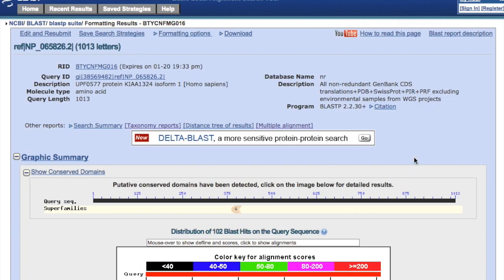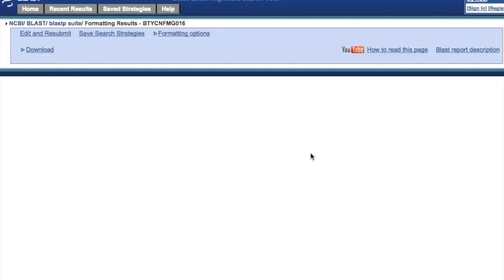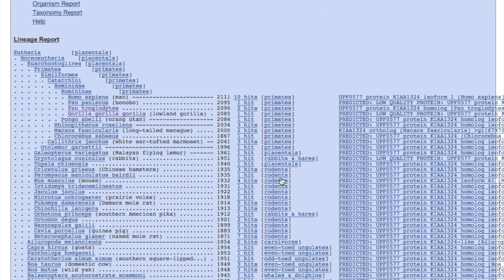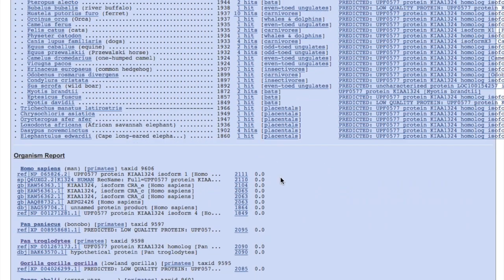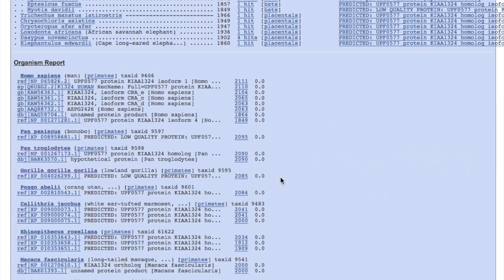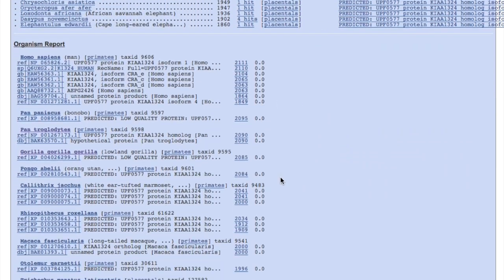And what we will do now is to click on taxonomy reports. And below are the organisms reports.